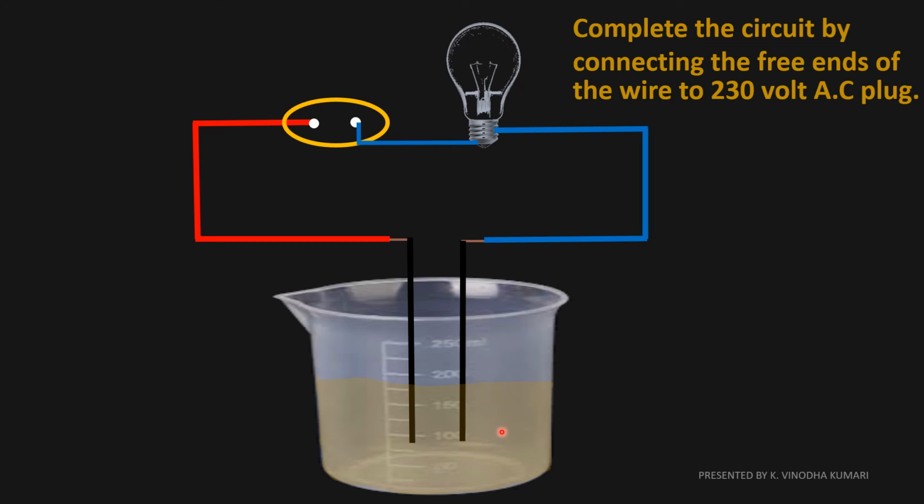So in glucose and alcohol, we are not finding any H plus ions in solution, whereas the positive ion, that is the H plus ion, is present in H2SO4 and HCl. So acids contain H plus ions in common, and these H plus ions are the characteristic properties of the acids. The movement of the positive and negative ions present in the solution will lead to the flow of the current. And the acids which contain H plus ions have the same chemical properties.